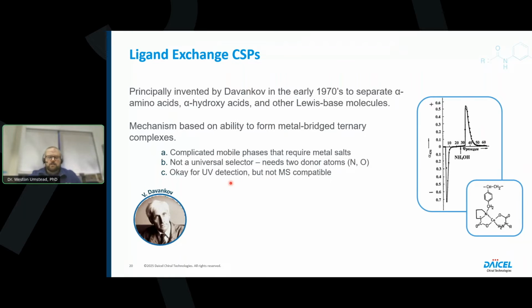Good for UV detection, and certainly at the time for challenging compounds like these amino acids, it was definitely a great innovation. But since then, we've come up with some improvements that allow for a little bit more versatility and utility for amino acids, especially.